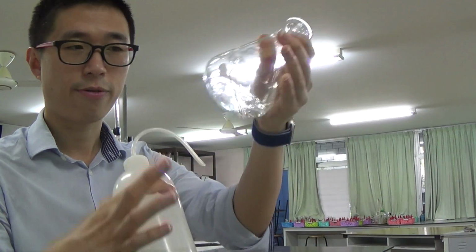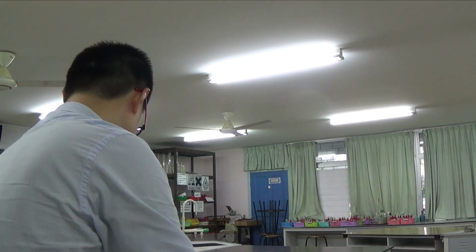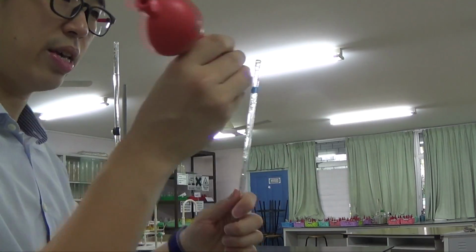So it doesn't matter if your conical flask is not dry or it's got some water in it, because it will not affect the mole of what you pipette into the conical flask, and therefore it should not affect what you have from your burette titer. So I haven't rinsed my pipette with the iodine yet.